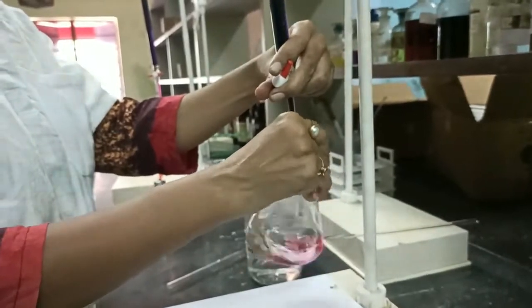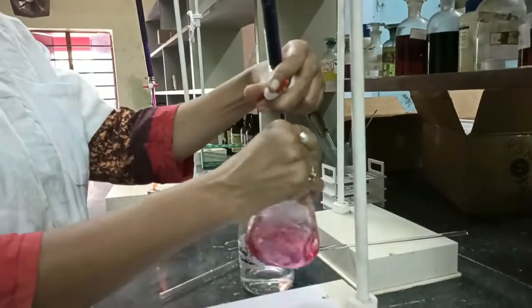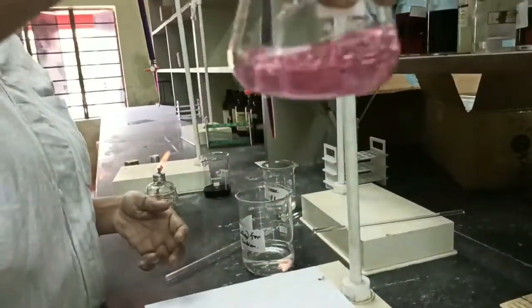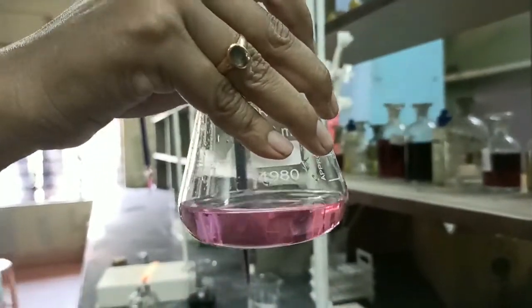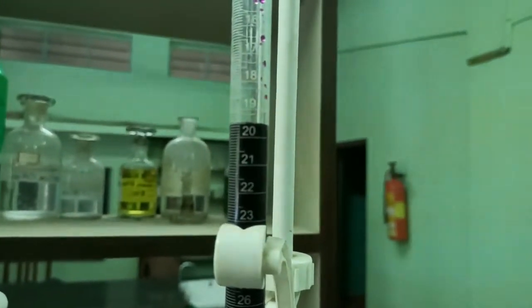You need to titrate with constant shaking. As you can see the color is coming and disappearing. When the color will persist that will be your end point. So that's the end point. This is the end point and the color is persisted. This is the end point 19.5.